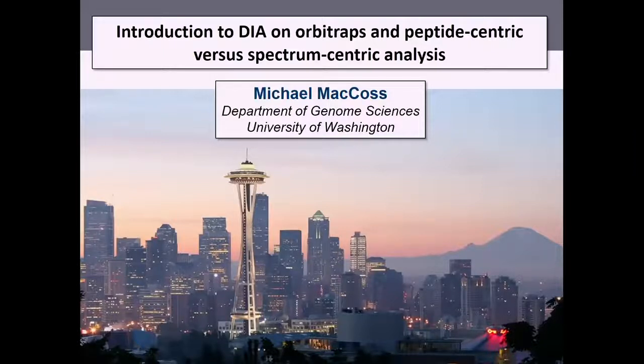So one of the things that I'd like to talk about is a little bit about how we view data-independent acquisition. In our lab specifically, what will be a little bit different is we're going to talk about some of the specifics of doing this on Orbitraps, and also a little bit about the topic of peptide-centric versus spectrum-centric analyses in general.